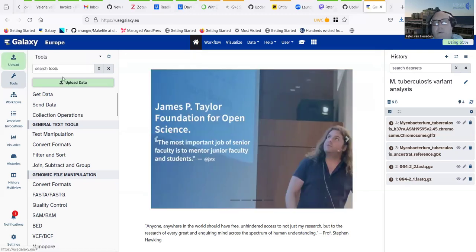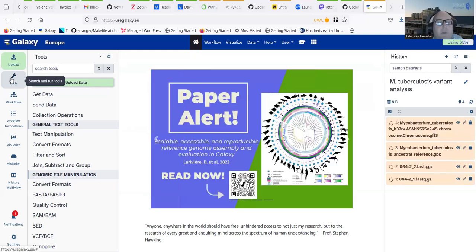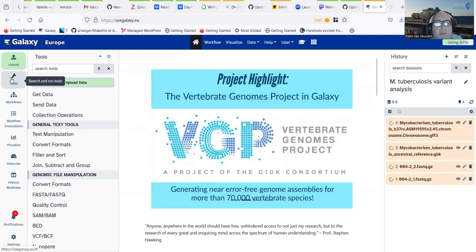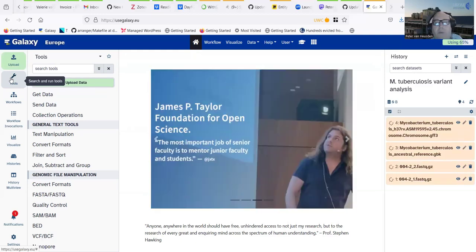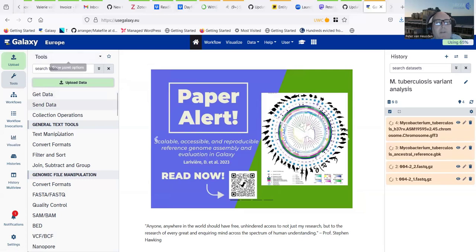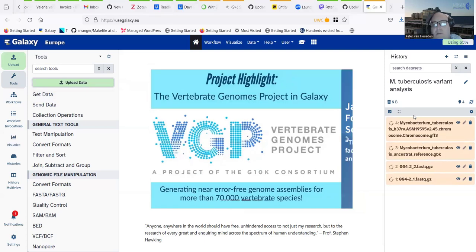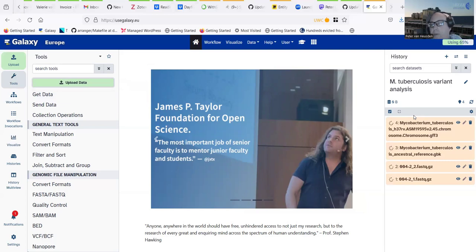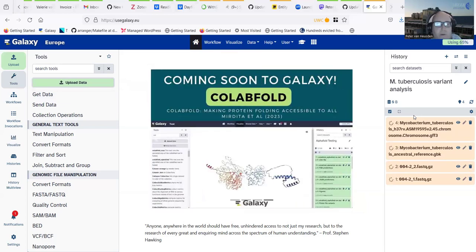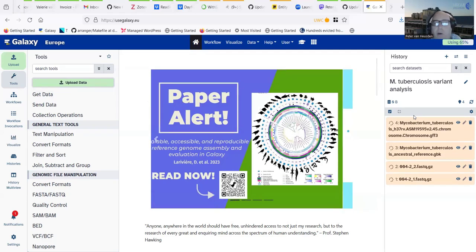On the left-hand side you'll see some Galaxy user interface features that might be unfamiliar — I'm using the beta version of the Galaxy UI as of June 2024. In a few months these icons in the sidebar may be familiar to you, but other people might just see the tools as shown here. The gray turned to yellow/orange, meaning the download of these datasets is busy taking place. I'll pause the recording while we wait for that download, making this recording in different segments.